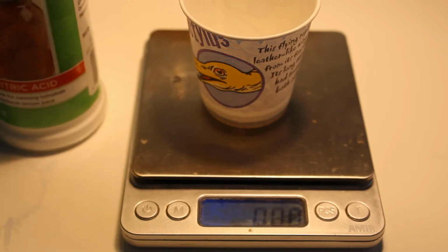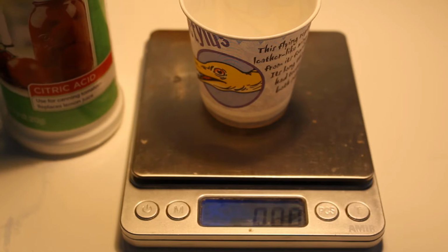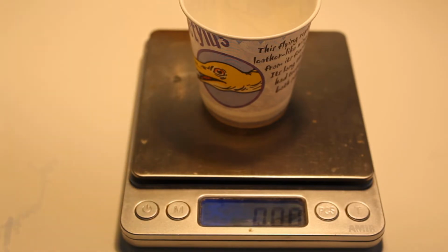In my case, my citric acid is only 98% due to anti-caking powder or something that they add in just so that it doesn't stick together in clumps, which could be useful, but in this case it's not. Because of that, I'm going to have to add some to the measurements, as the anti-caking agent is insoluble in water, so I should be able to just put it through a coffee filter and get it out. But before we can do that, we're going to have to measure it out and be conscious of the amount, because this has to be exact.